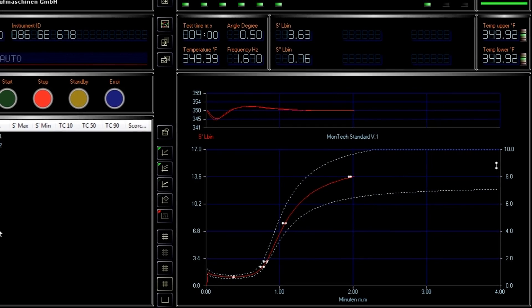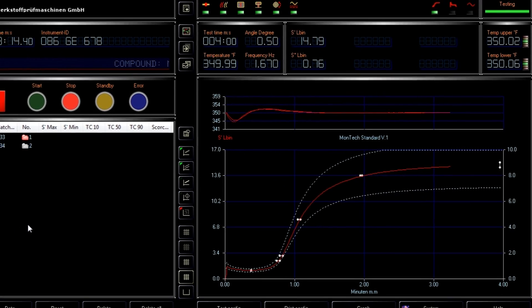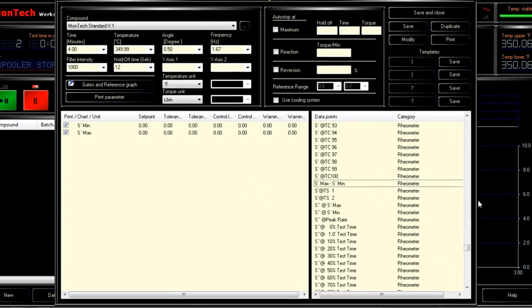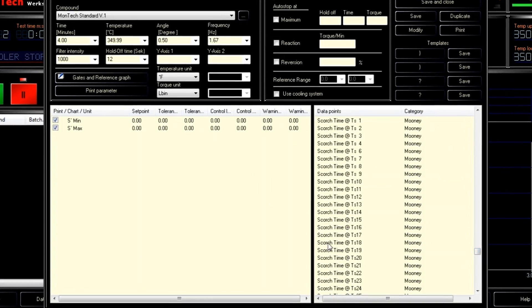MonControl is designed to meet modern testing needs and comes with a large variety of test methods that can be easily selected from a preloaded list, allowing new operators to start testing within minutes.